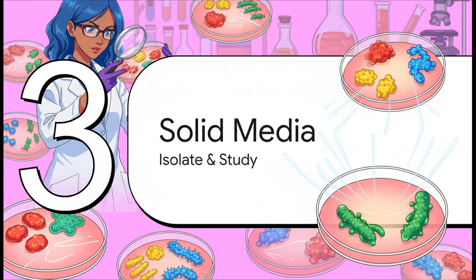All right, let's switch gears and pick up the next tool in our kit. This one solves a totally different problem. What if you don't have a pure culture? What if you've got a messy mix of all kinds of different bacteria, and you need to separate them out so you can study them one by one? Well, that is where solid media comes in.